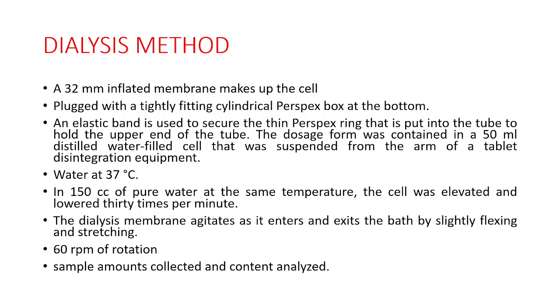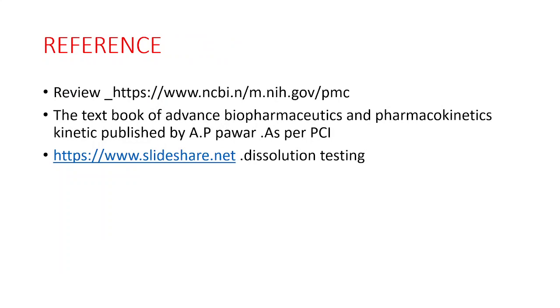The cell was elevated and lowered 30 times per minute. The dialysis membrane agitates as it enters and exits the bath by slightly flexing and stretching. 60 rpm of rotation is used in this dialysis method, and samples are collected and contents are analyzed.